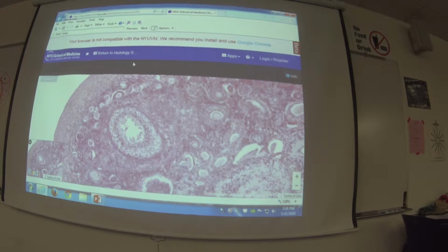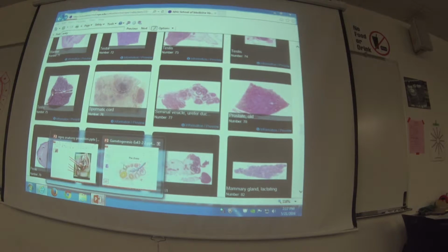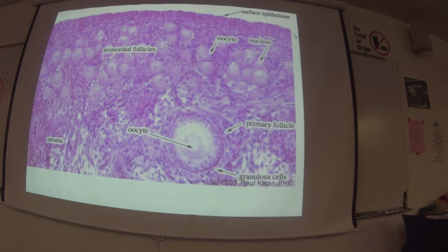Let's see if they have a different slide at a different time of the day. Let's see, that's corpus luteum. Let's go back here. This is the one for the PowerPoint slide. So again, just take a look at those.